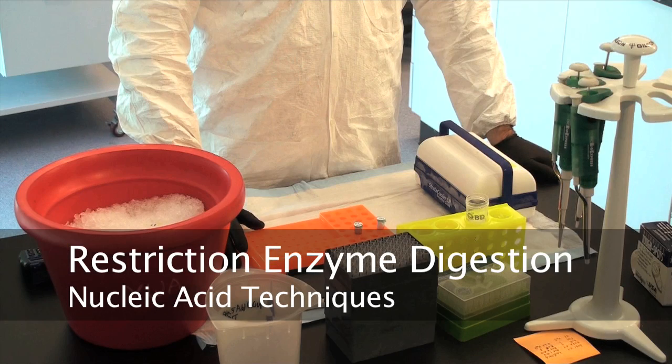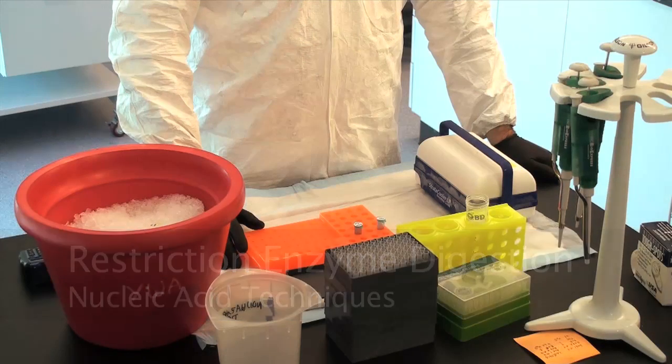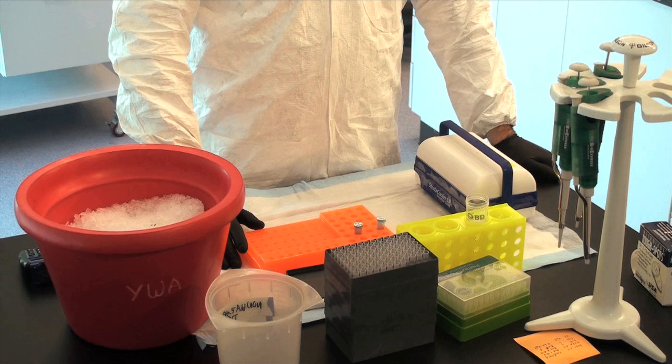Restriction enzyme digestion. A restriction digestion is when DNA is digested using what is called a restriction enzyme. A restriction enzyme is a surgical scalpel. It will cut up DNA, but only where one specific sequence of base pairs exists. This sequence is usually four to six nucleotides in length and is different for every restriction enzyme.